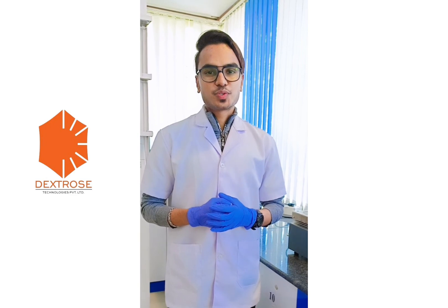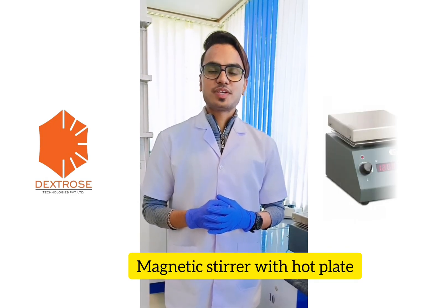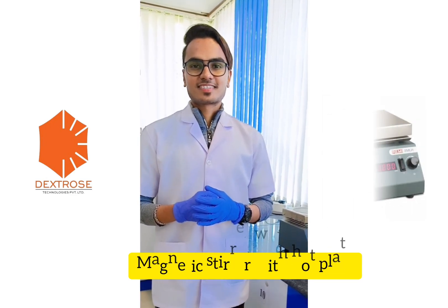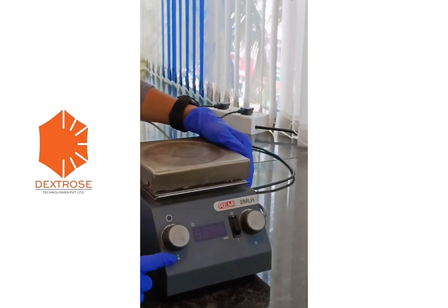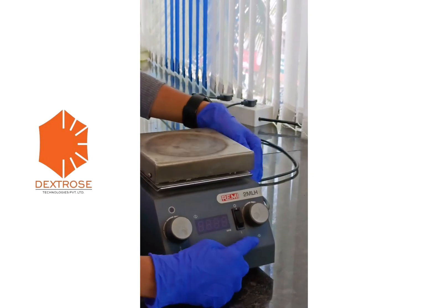Hello everyone. Today we are going to see how to operate a magnetic stirrer with hot plate. This is how the equipment looks — it consists of a temperature knob to adjust the temperature and a speed knob to adjust the RPM.